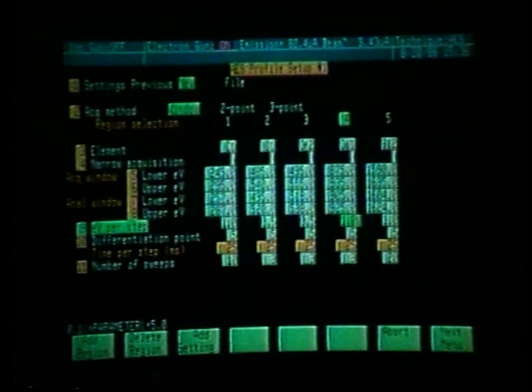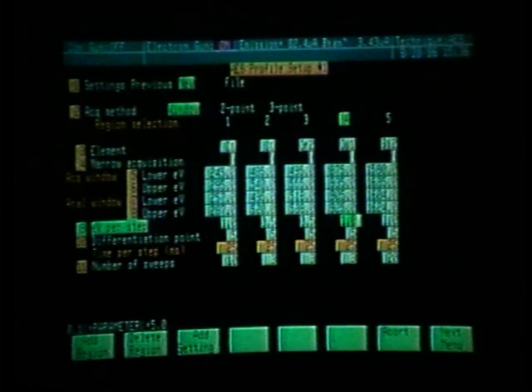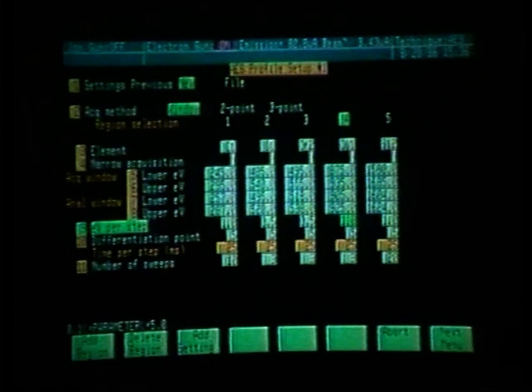If we then pressed soft key number 2, we would delete the copper region, and our analysis would be done on carbon, oxygen, chromium, and silicon. Again, now that we have the parameters entered, we can go to the next menu by pressing soft key number 8.